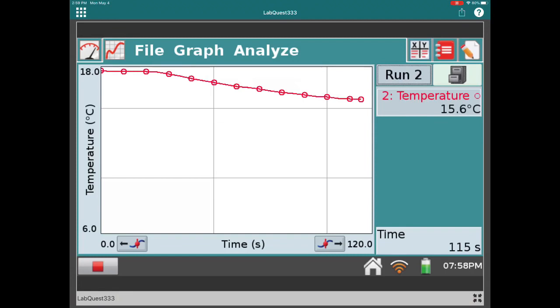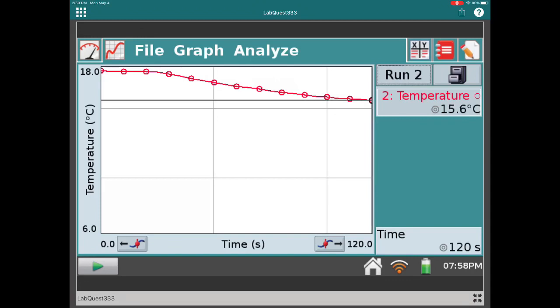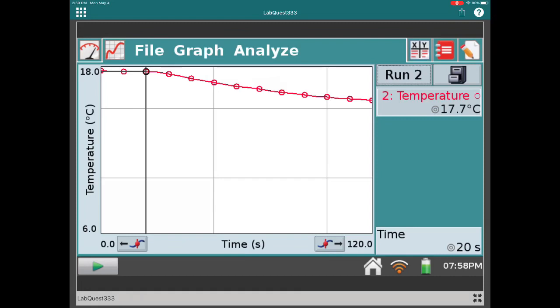So we're done collecting the data. Let's see what the final temperature was and record that. Click on the last data point — there you go — and record that final temperature for 1-propanol. And now let's remind ourselves of the starting temperature. Now you can calculate the change in temperature for this alcohol and compare it to what we saw for ethanol.